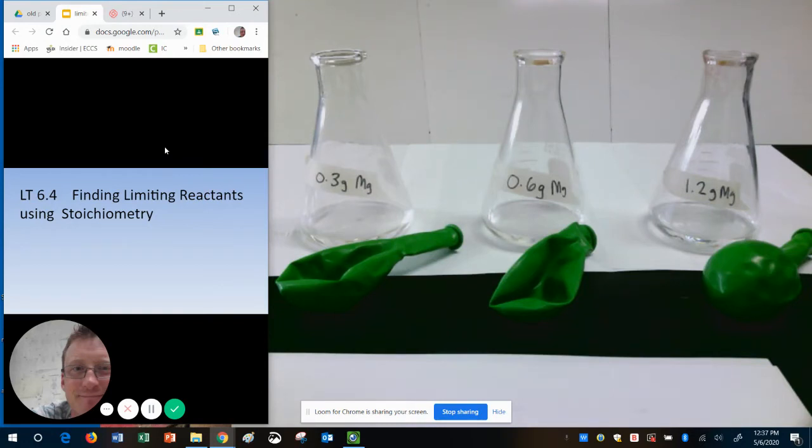Hello everybody. Today I'm going to show you a quick demonstration on limiting reactants. I'm going to show you visually how we can tell if we have limiting reactants and then also show you the math behind some of it. Hopefully by the time we're done you'll see why chemists use stoichiometry in order to actually do some of this stuff.